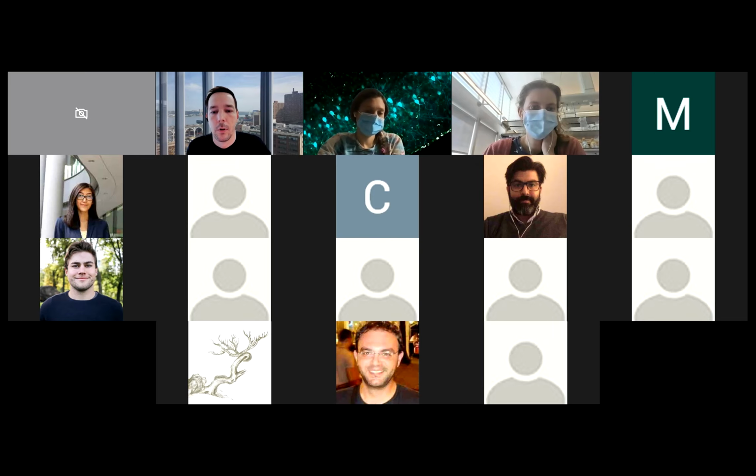But that's just practice. What I like with that software, I haven't used yours yet, but I already saw it and I'm going to try it, is that the registration can be adjusted. On a single image, if I see that the ventricle, for example, the matching was no good, I can manually adjust the points. Is it possible to do that in the registration in your plugin or not?